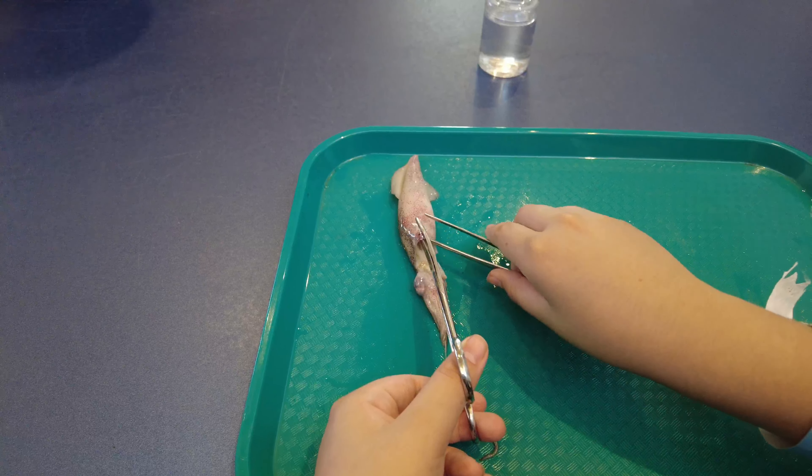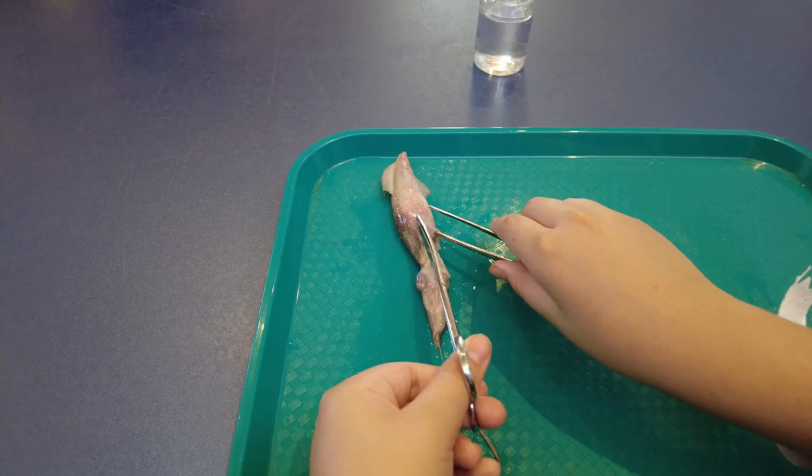So you're going to cut all the way to the top and then you're going to split it open. Perfect. Okay.